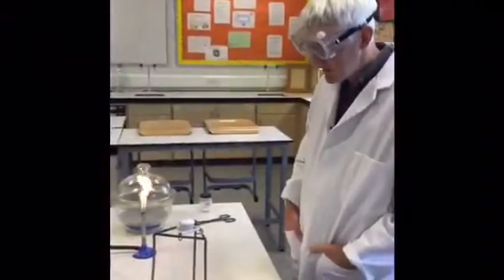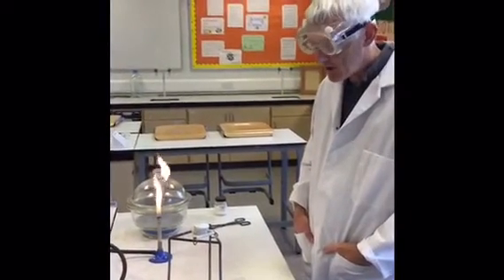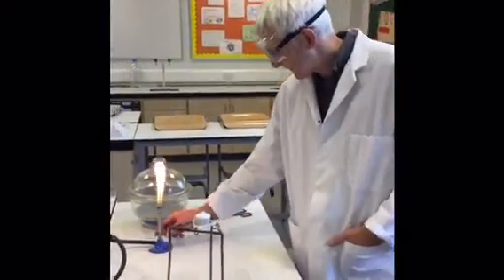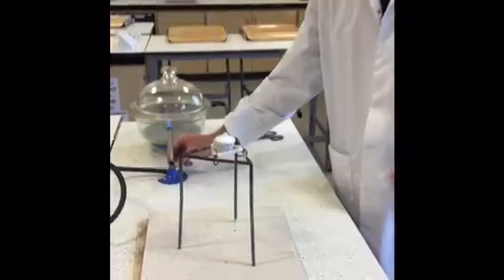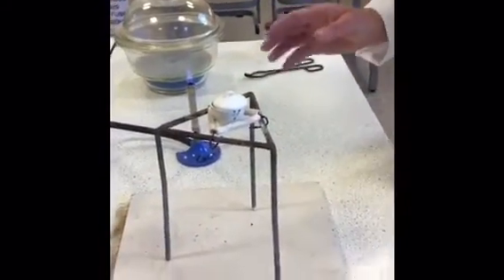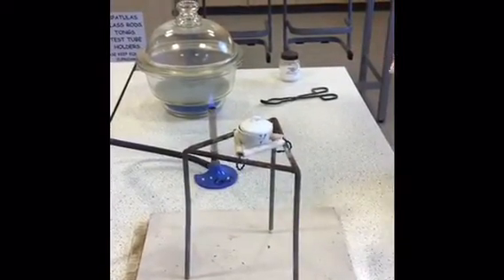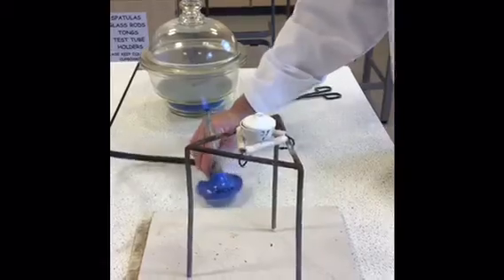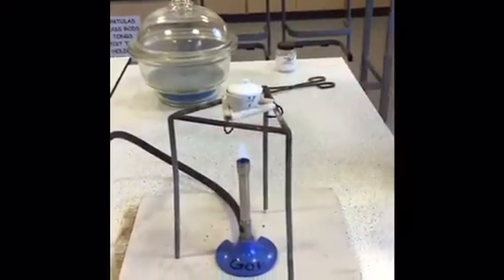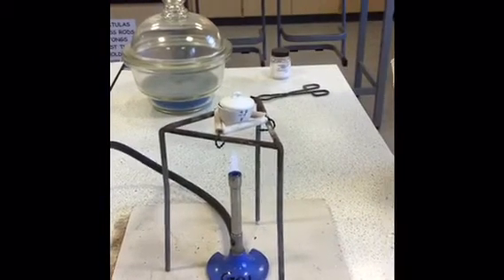Okay, so the first thing we're going to do is heat up the crucible for 10 minutes in order to get rid of any water that might be absorbed onto the surface of it. So we want to use the blue flame at all times, because if we don't use blue flame we'll get some carbon deposits on it which will mess up our weighing. Okay. So we're just going to roast this for 10 minutes just to drive off any water.